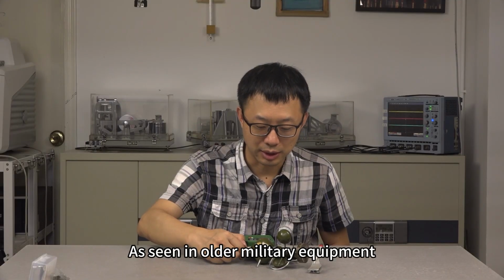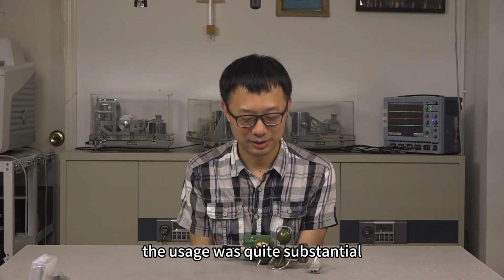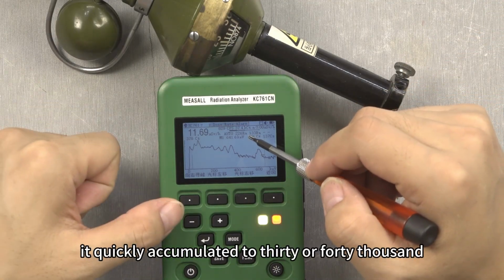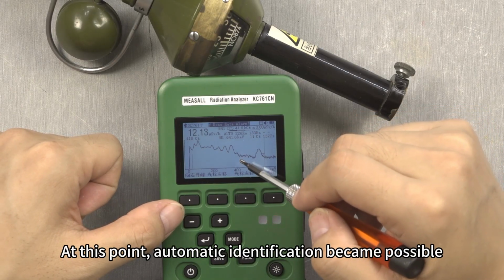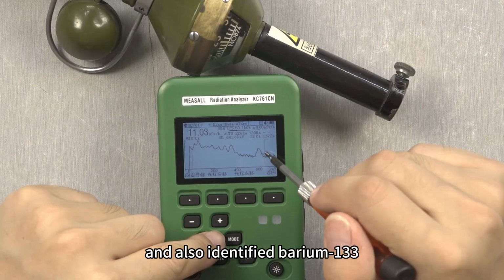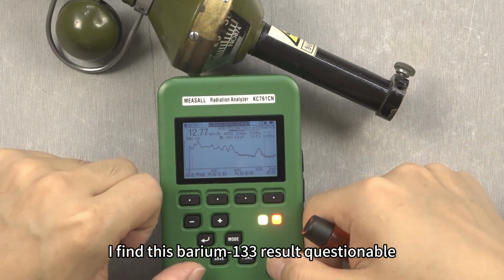Now let's place our anemometer, as seen in older military equipment. The usage was quite substantial. At the time, little attention was paid to whether it was safe or not. Due to the high radiation intensity, it quickly accumulated to 30 or 40,000 counts. At this point, automatic identification became possible. It identified radium-226 and also identified barium-133. I find this barium-133 result questionable.